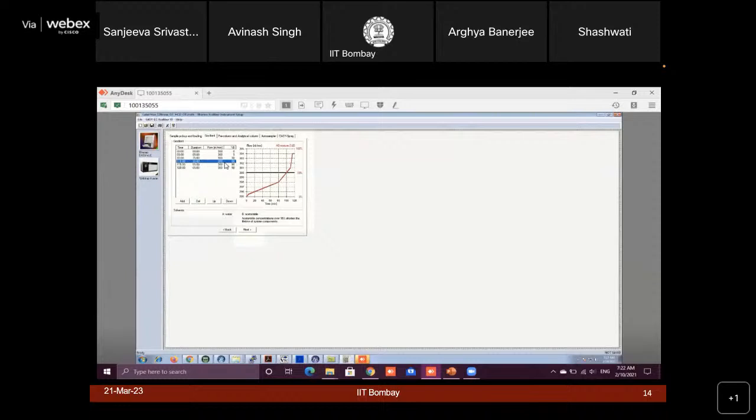So basic logic is I am using two solvents. One is hydrophilic and the other is hydrophobic. That is A and B. My solvent A is hydrophilic and my solvent B is hydrophobic. When I am gradually increasing the percentage of my hydrophobic solvent, whatever the hydrophilic peptides are there will be eluted first, followed by hydrophobic peptides. Okay. So this is the logic.